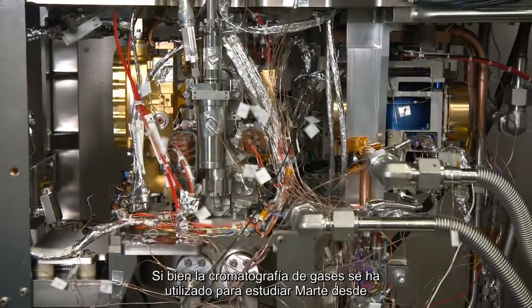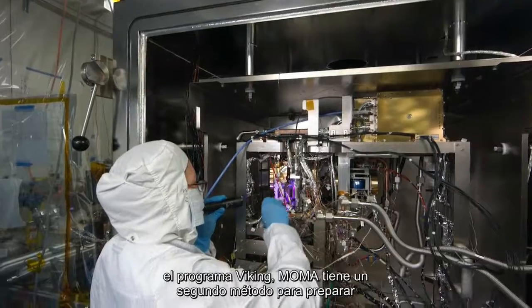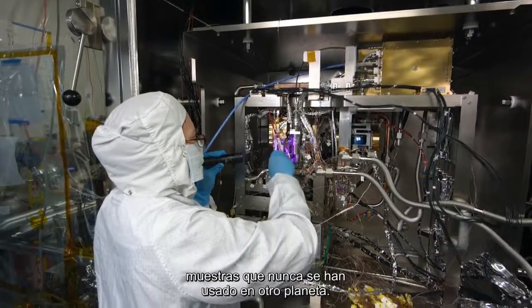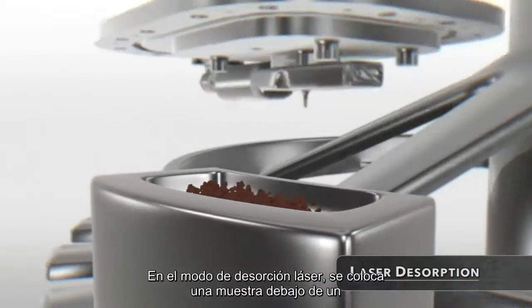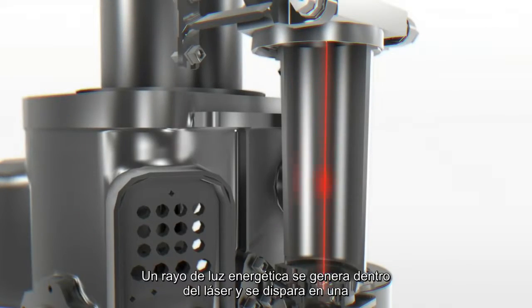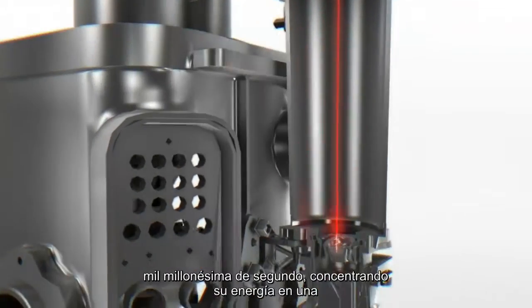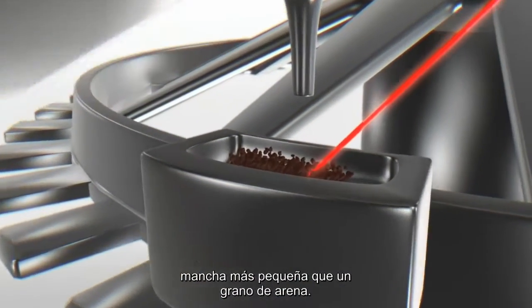While gas chromatography has been used to study Mars since the Viking program, MOMA has a second method for preparing samples that has never been used on another planet. In laser desorption mode, a sample is placed beneath a powerful ultraviolet laser. A beam of energetic light builds within the laser and fires in a billionth of a second, concentrating its energy onto a spot smaller than a grain of sand.